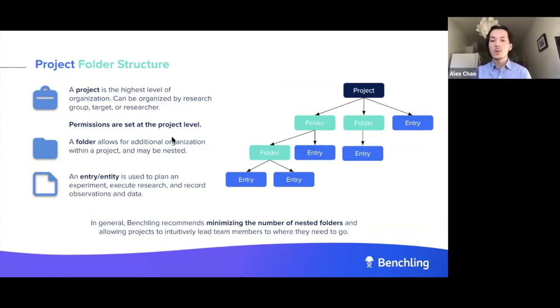The highest level of organization within the notebook is called projects. So a project is a way for you to set permissions for the data within the notebook. Importantly, any notebook entries that live within a project will gain their permissions from that project.